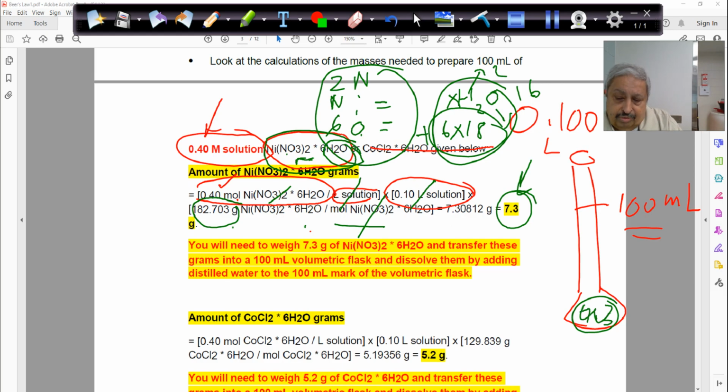When you add water here, you have to add 100 mL, but you will never add 100 mL at once. You will add a couple of milliliters of distilled H2O, 10, 15. You don't have to count. The main thing is, as you add, keep shaking until everything is dissolved. Then you can fill all the way with distilled H2O to the line here.